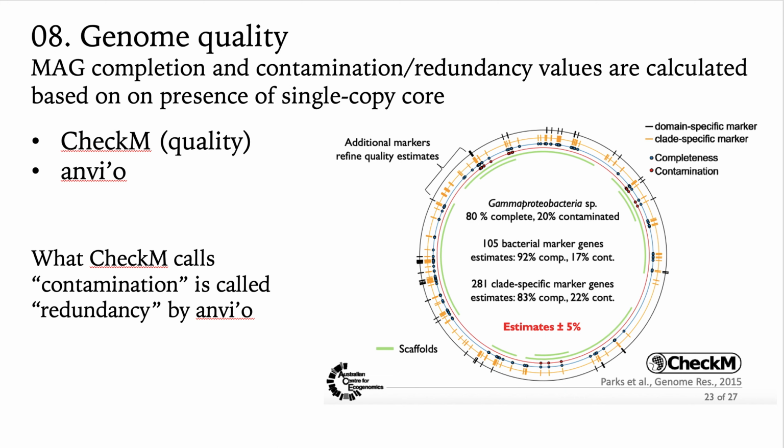So once you have your MAGs, you should really only work with high quality MAGs, because posting low quality, incomplete genomes onto public databases can be a disservice to the community. Someone might download a genome and think it represents an organism, but in fact it's highly contaminated. Contamination can also be called redundancy.